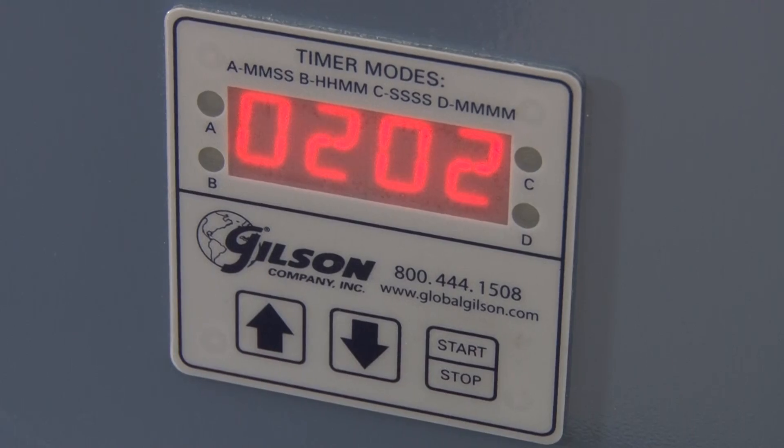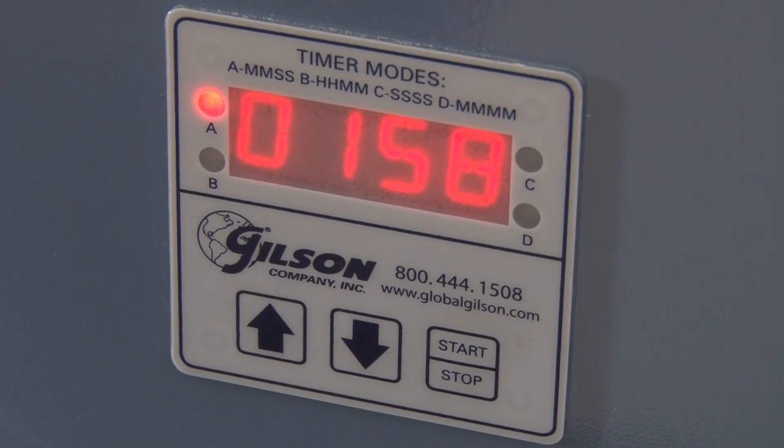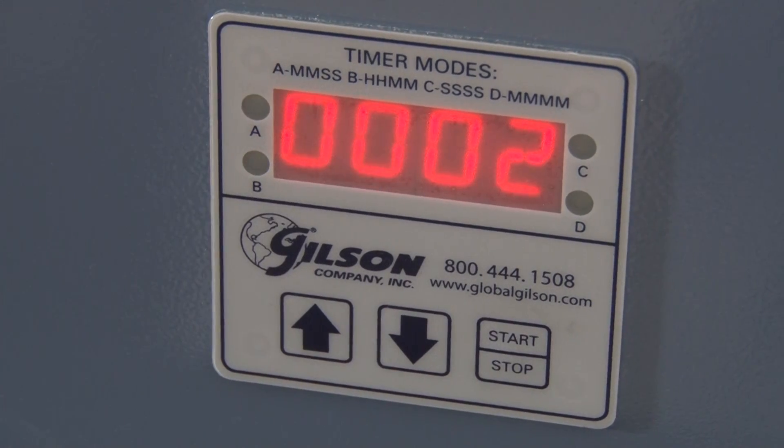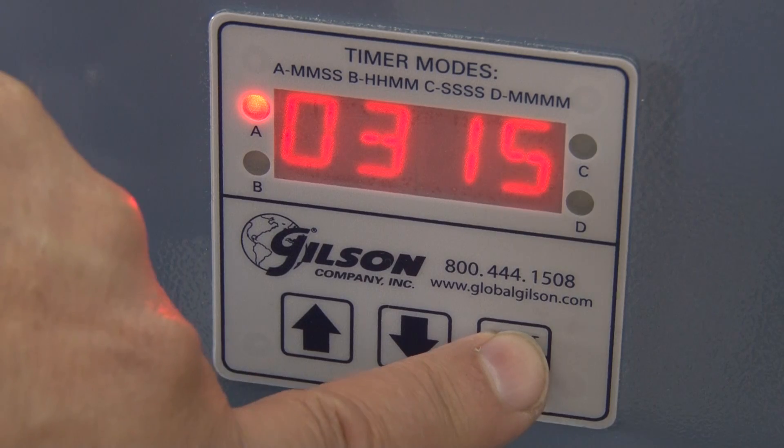The digital timer features a large LED display and a mid-cycle pause function. And for convenience, once the cycle is completed, the timer will automatically reset to the desired test time.